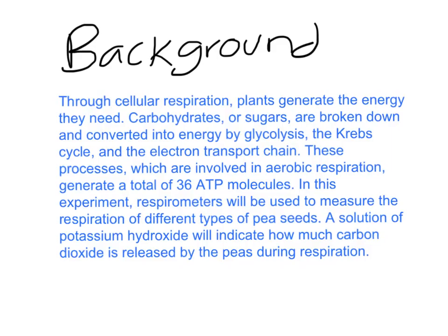In this experiment, respirometers will be used to measure the respiration of different types of pea seeds. A solution of potassium hydroxide will indicate how much carbon dioxide is released by the peas during respiration.